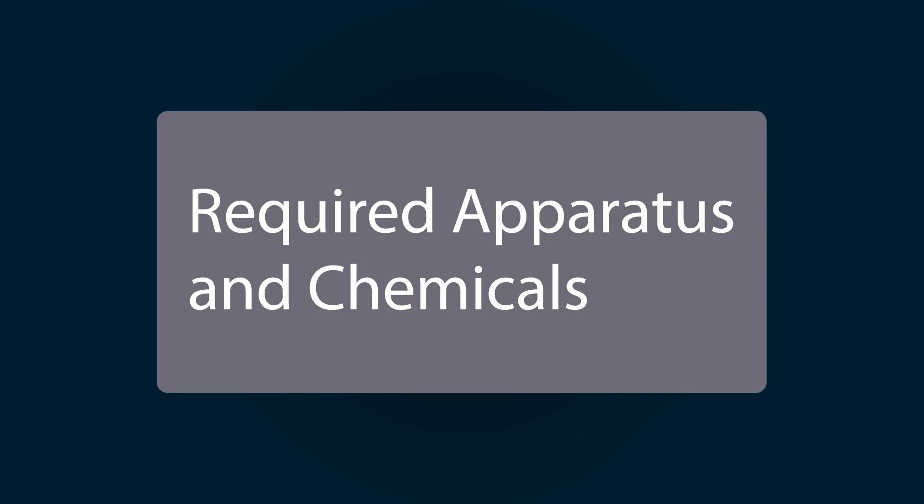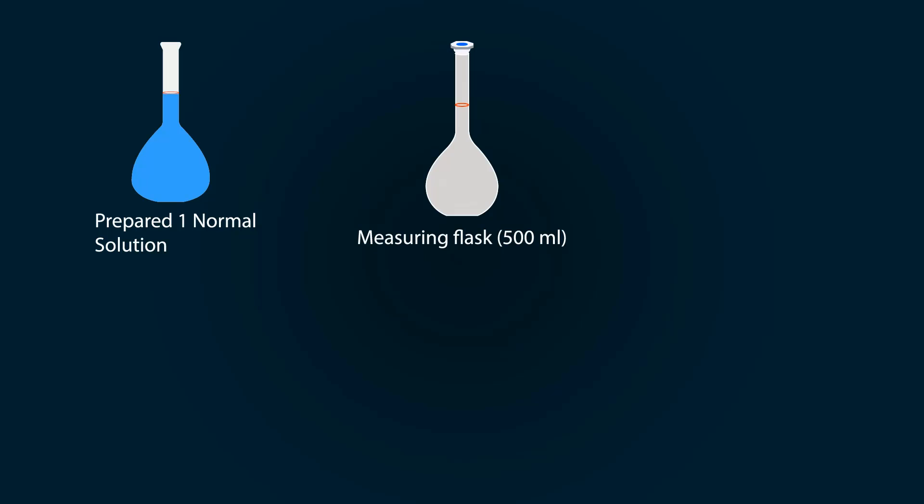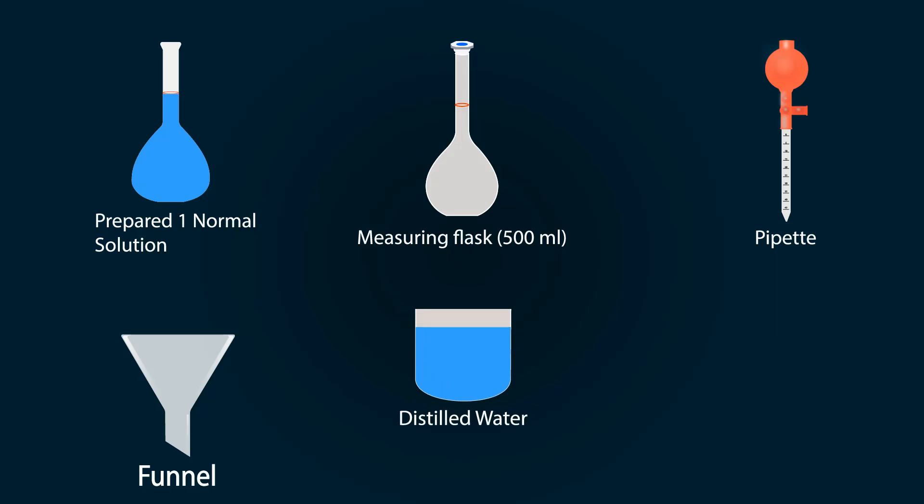The required apparatus and chemicals include prepared one normal solution, a measuring flask of 500 ml, a pipette, a funnel, distilled water in a beaker, and storage tank.